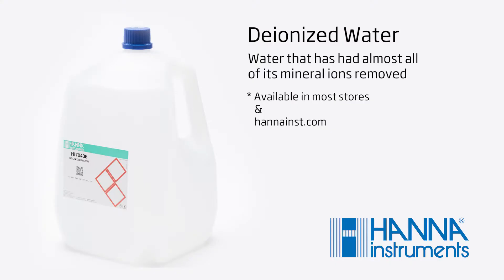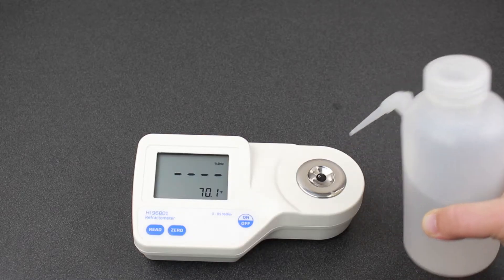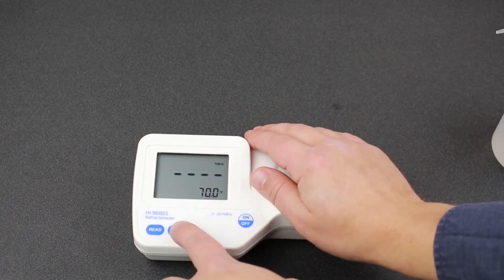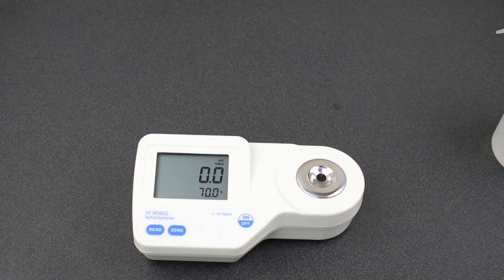Before analyzing your samples, first calibrate your Brix refractometer with DI water. Deionized water can be found at your local store or pharmacy. Be sure to fill your sample well to completely cover the prism glass. Cover the well with your hand to prevent any stray light and press zero to complete your calibration. Now we're calibrated.